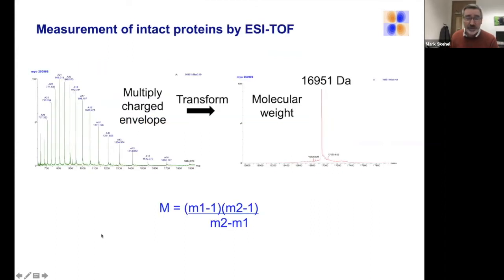So we have an instrument in the lab, there's the Zevo, but we also have an LCT, a little TOF instrument, which is the only open access instrument in the facility. It's open to people who'd like to be trained. So if you have a protein that you'd like to measure, come down and see us, and Frida will show you how to use that instrument. Here's an example of what we're looking at.